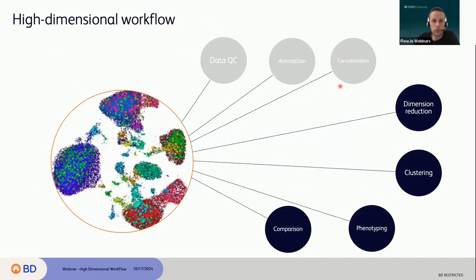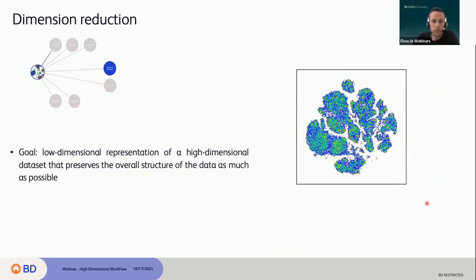All right, so that's it. We're done with the first three cleanup steps. So now we're going to go to our algorithm: dimensional reduction and clustering.